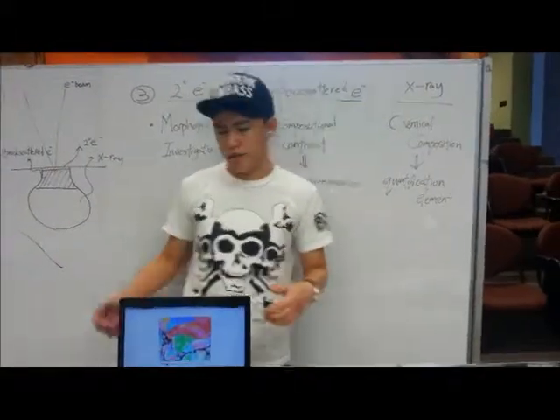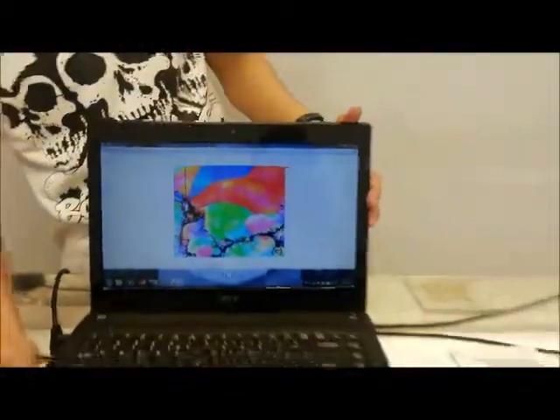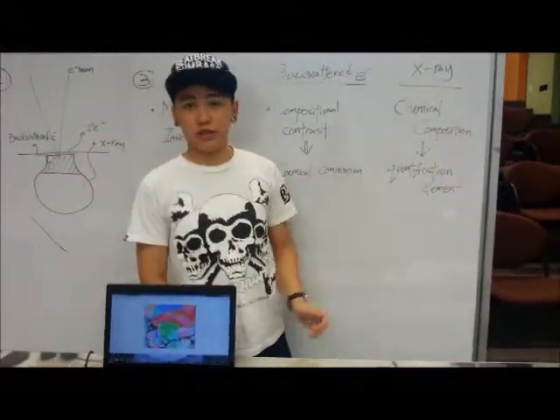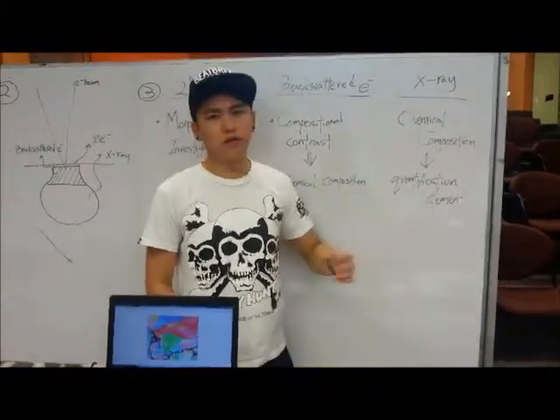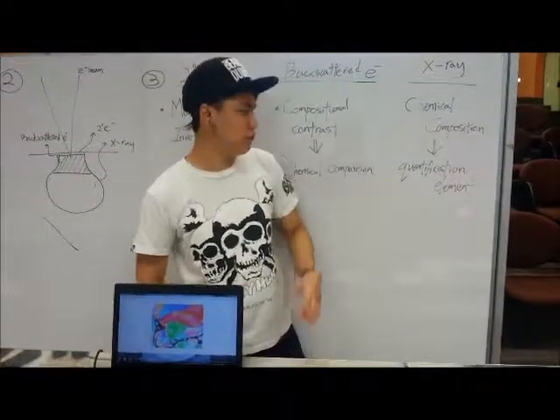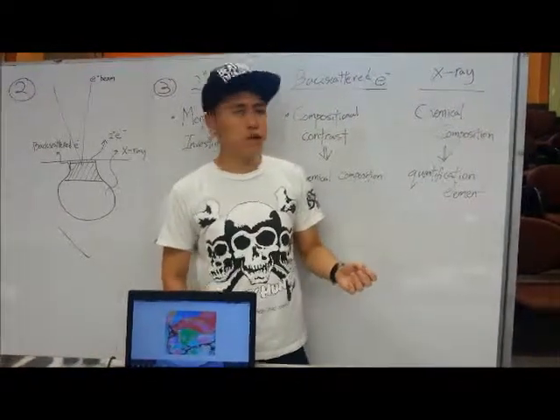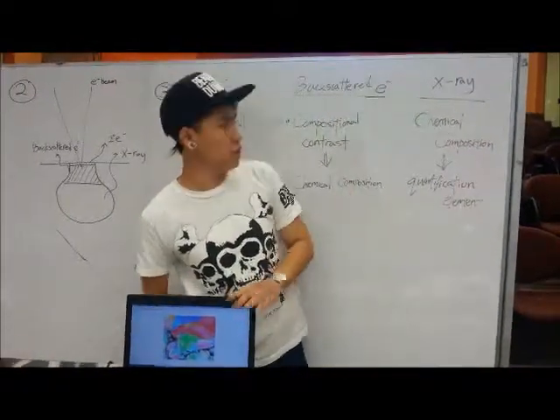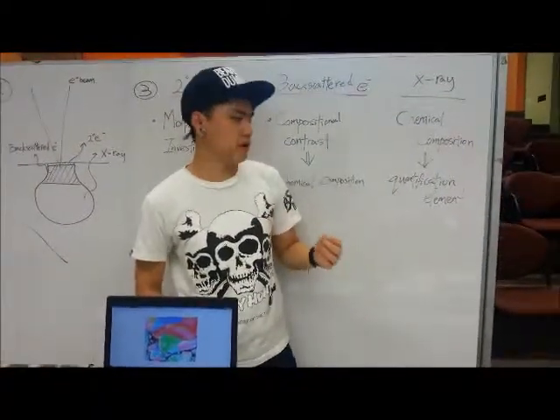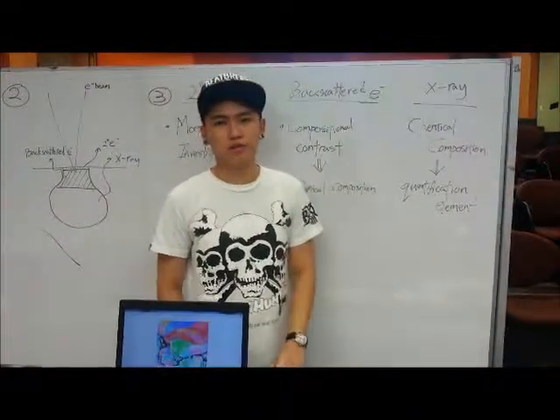Now we'll take a look at the image produced by the X-ray. For X-ray, it can also be used in the research industry because the research industry requires high accuracy in material composition. For example, in the aerospace industry, we can use the image obtained from the X-ray to enhance the formula of the nanoceramics based on its chemical composition.